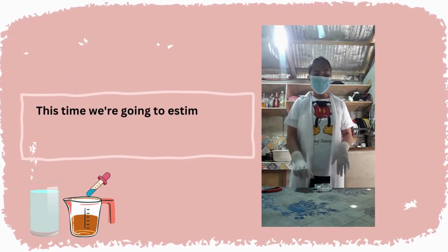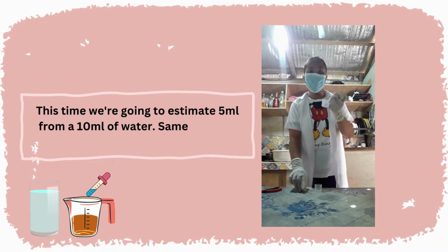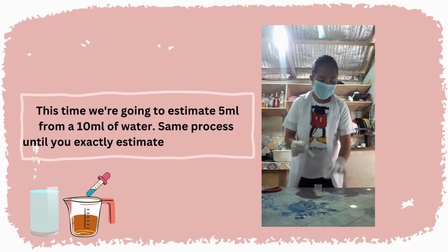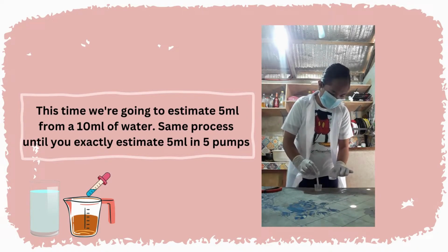Then, this time, we are going to estimate 5 ml from a 10 ml of water. Same process until you exactly estimate 5 ml in just 5 pumps.